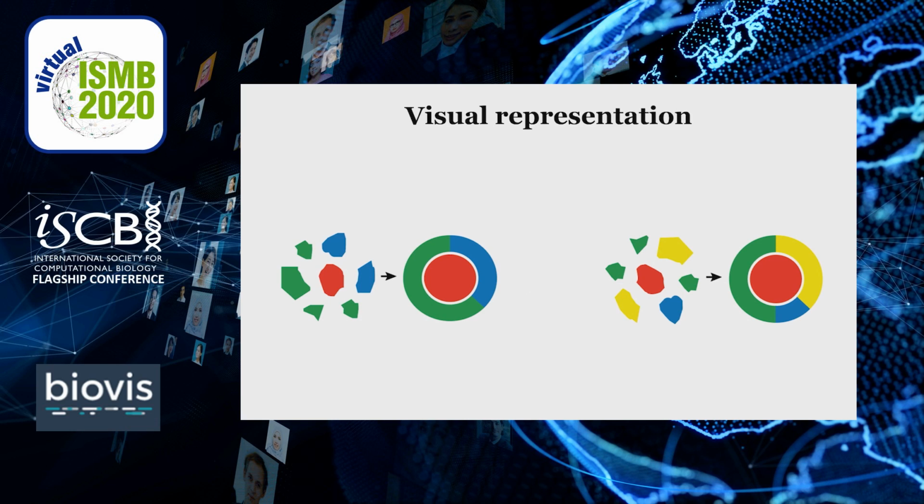For the representation of a motif, we utilize a simple glyph based on a donut chart, with a circle in the center showing with its color the cell phenotype of interest. The colors of the arcs show the phenotypes that exist in the microenvironment and their size, the frequency with which they exist in the microenvironment. To use it for visualizing the detected motifs, we need to extend the design to group all the microenvironments that belong to the same motif.